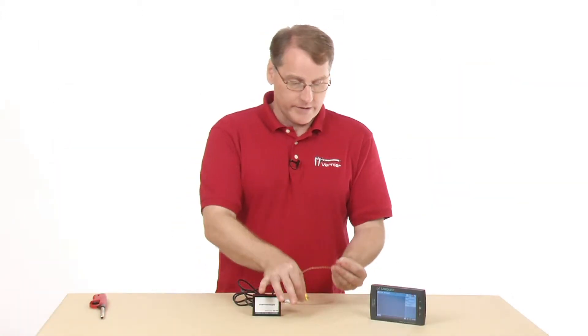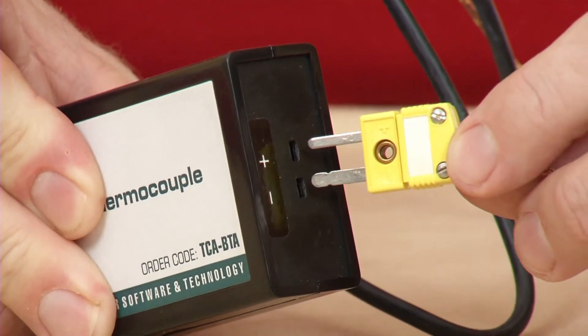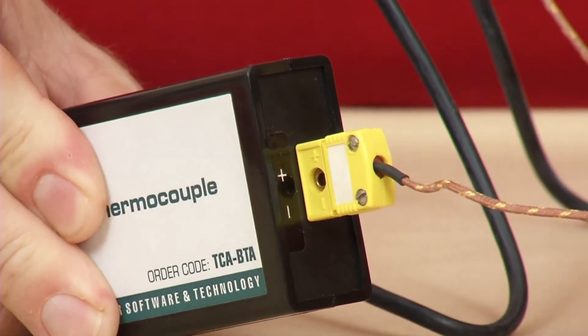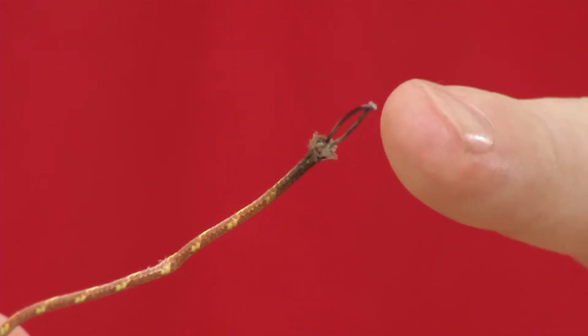The way this thing operates is that this is the actual sensor wire, and it ends up being plugged into the thermocouple. This wire is replaceable if something happens to it, so you just plug it in there. And the sensitive part of the detector is right down here at the end.